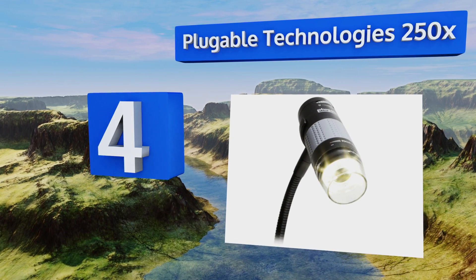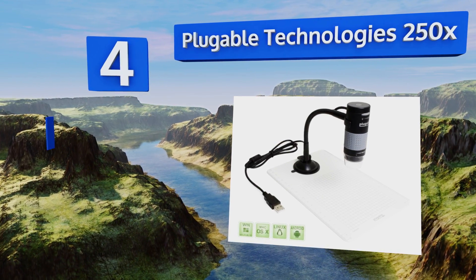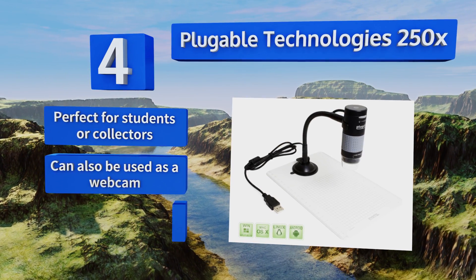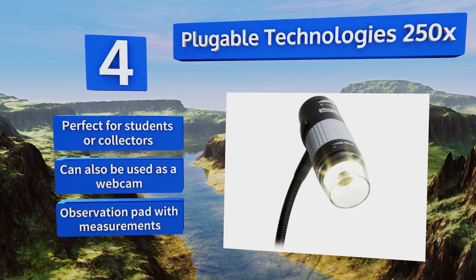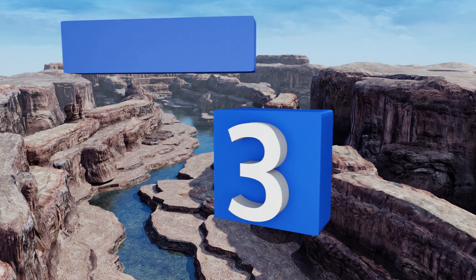At number four, the value-priced Pluggable Technology with 250 times magnification has a handy flexible arm on its stand for quick and easy adjustments. The built-in LED halo light comes with brightness controls, and it functions with all operating systems including Linux and Android devices. It's perfect for students or collectors and can also be used as a webcam. It comes with an observation platform paired with measurements.